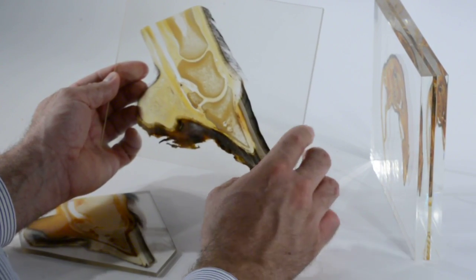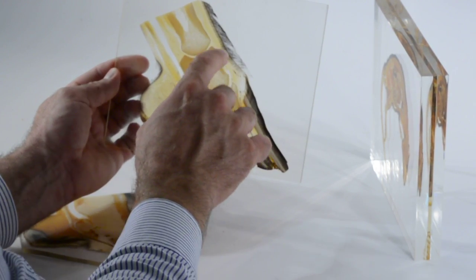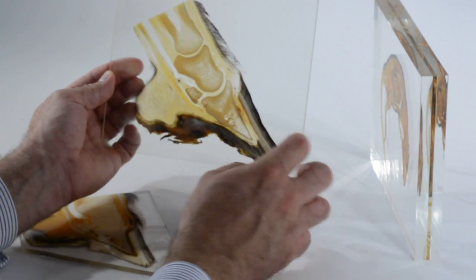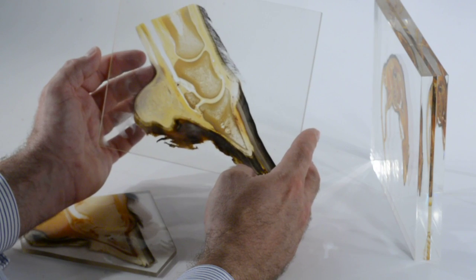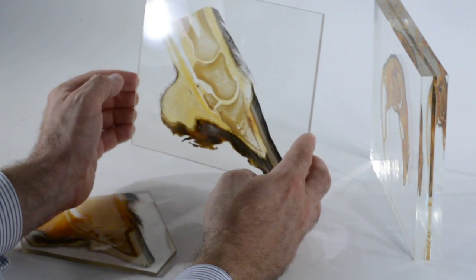It has a very clear vision of finest details in the specimen. You see the hair roots here, you see cartilage, blood vessels, all finest details, usually used for teaching, but also for research, and whenever you want to see all the fine details.